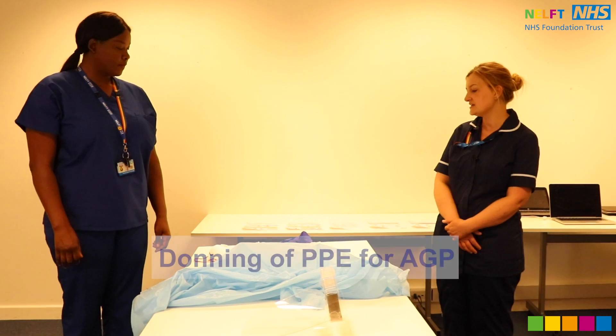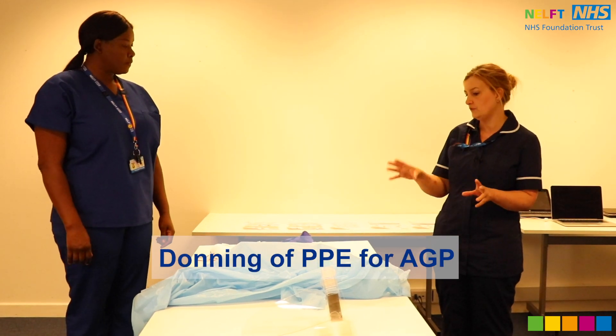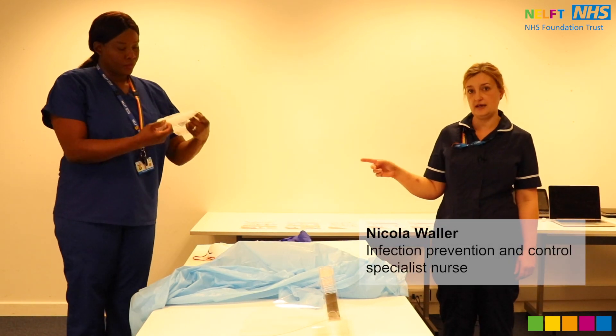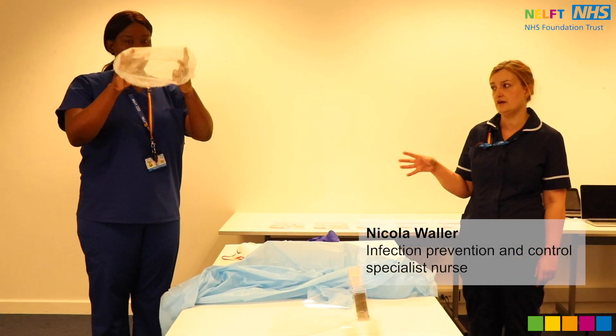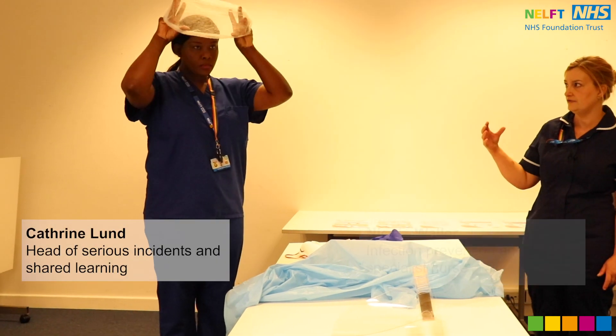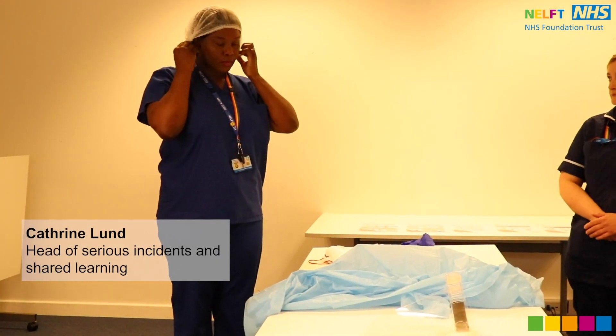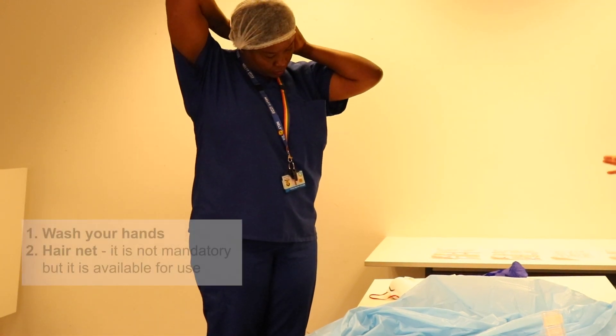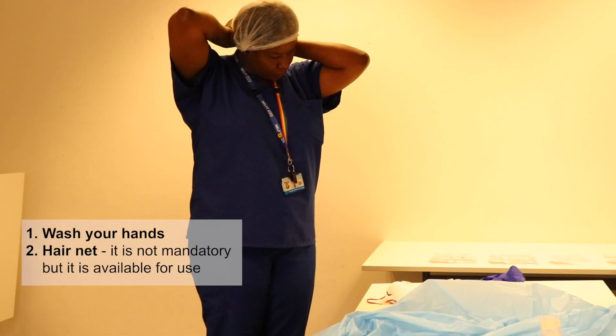We're going to demonstrate now what you wear for AGP. If you choose to wear the hairnet — it's not part of the guidance but they are available in NELF — you can put that on first. You should have already washed your hands at this point; that's the first thing you would do before putting that on.